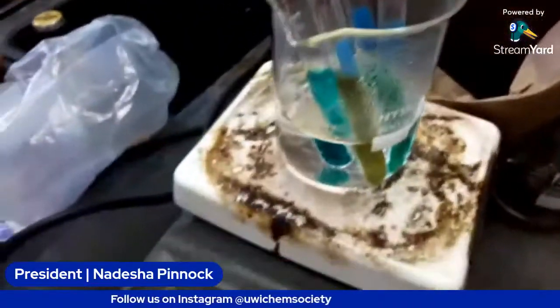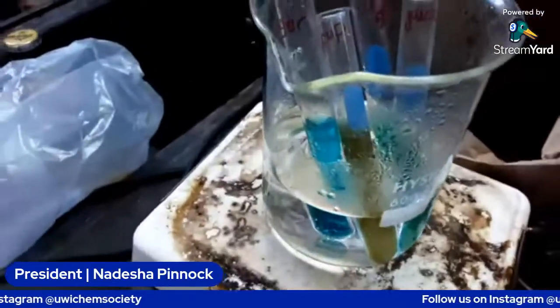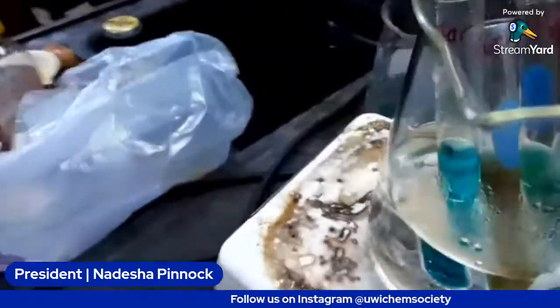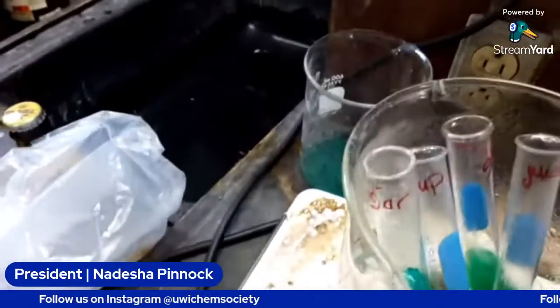Right. So this is where we have set up our rerun of the reducing and non-reducing sugar test. This time I added the labelings at the top so they won't come off.